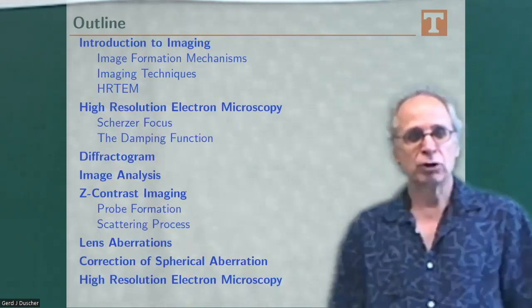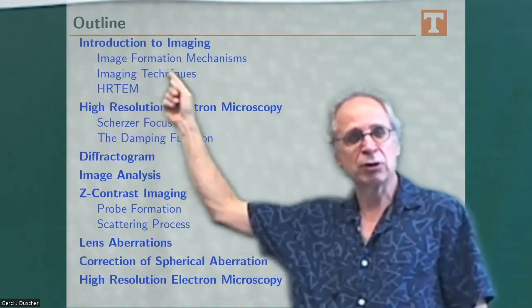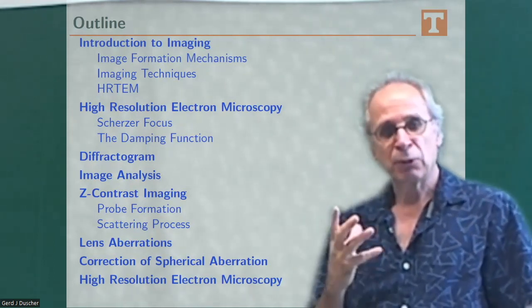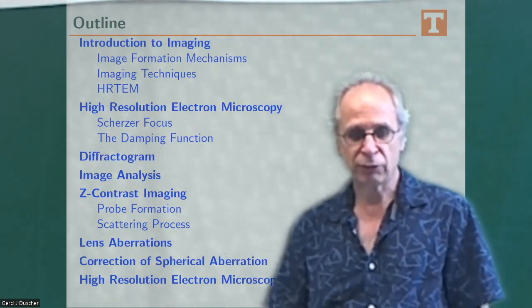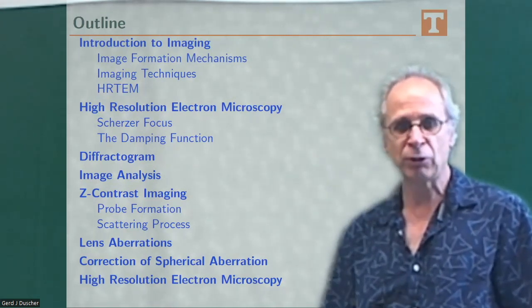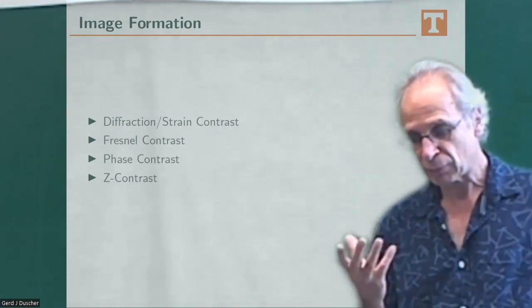This is what we want to do today. We go briefly over the different parts of our microscopy. Which image formation techniques do we have? And then we focus mostly on which kind of information is preserved through aberrations and which has to be investigated in more detail. To what extent can you naively interpret them? That's a key thing. If we talk about image formation, we have different contrast formation mechanisms.